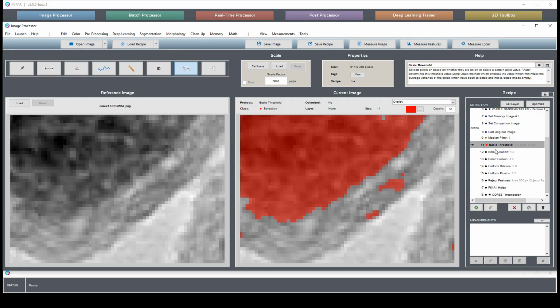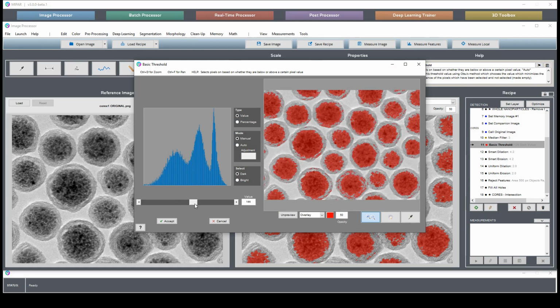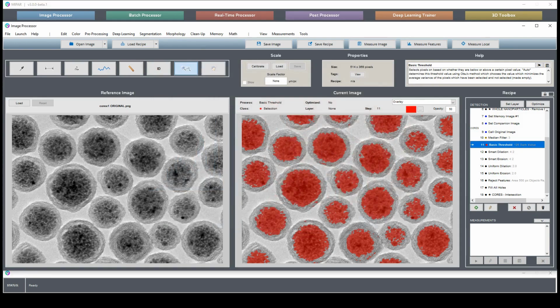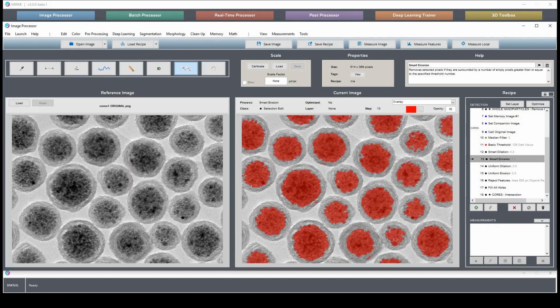So these spots on the shells, if we increase our basic threshold to grab that, of course all this gets found. So that's not a thing that we want to do. And we could have done a few more iterations perhaps here to be better at joining pieces that maybe should be included in the cores, like this piece here, which didn't end up being captured. But again, it's a trade-off that we had to make to prevent pieces like this from inadvertently getting added to the cores.